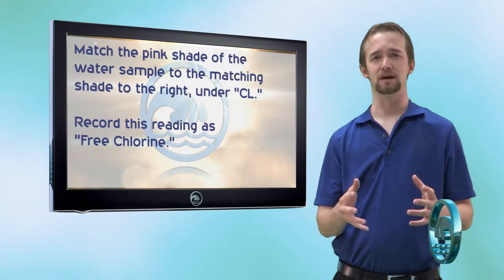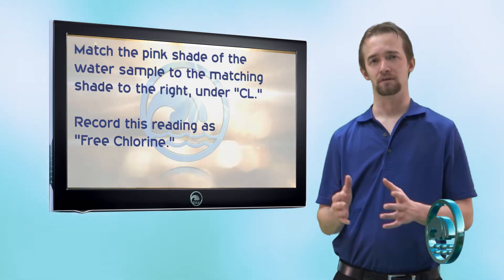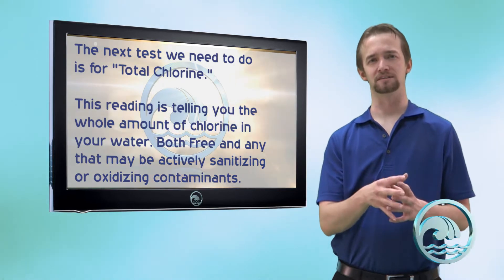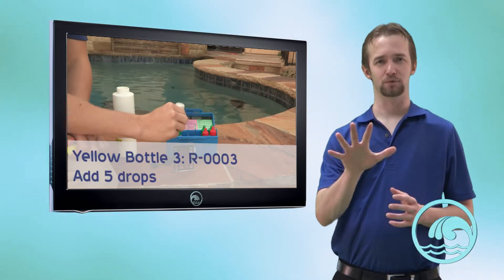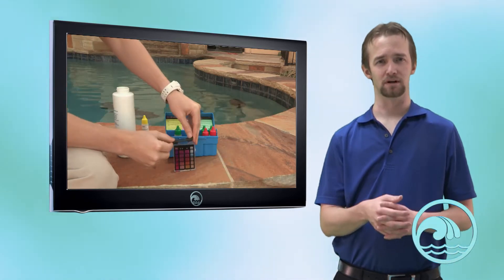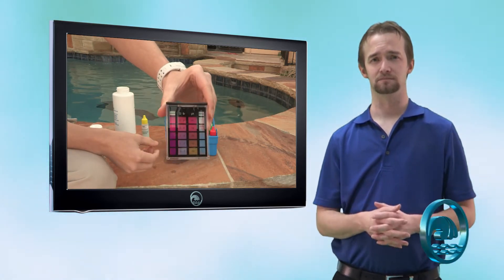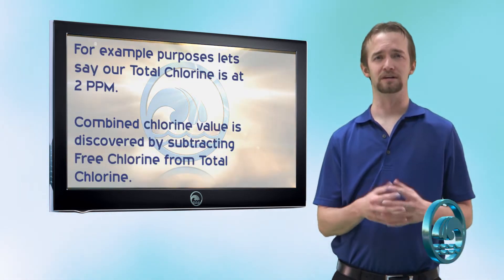For example purposes, let's say that we got a free chlorine reading of one part per million. Now the next thing we need to test for is called total chlorine — the entire amount of chlorine, both free chlorine and chlorine that is actively combating some contaminant in your water. Take R0003, add five more drops into the exact same sample. Using the caps provided or just your thumb, cover the compartment and give it a good shake. Compare the shade of pink to the one underneath the CL column. For example purposes, let's say our total chlorine reading is two parts per million.